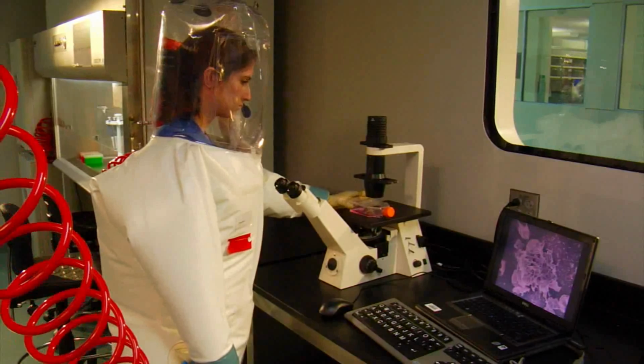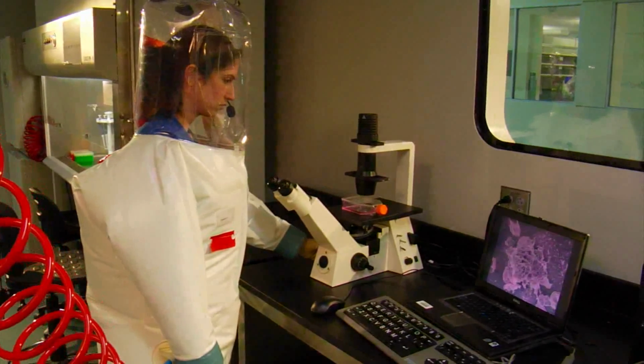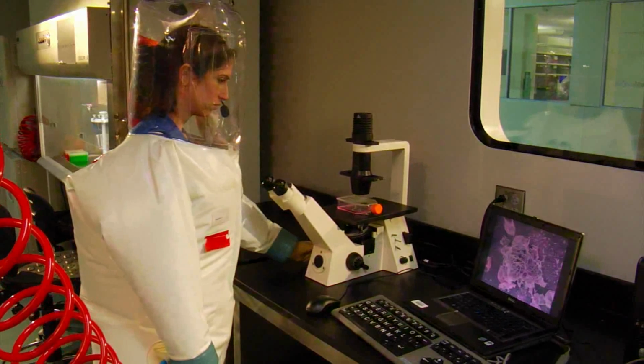Biosafety level 4 laboratory environments are extremely inconvenient to work in because of having to work in the positive pressure suits and the level of concentration that's required to work in there. So as a result, many of the studies are done on components of biosafety level 4 agents which have been inactivated and taken out of the biosafety level 4 lab. Then they can be safely worked on at biosafety level 2.